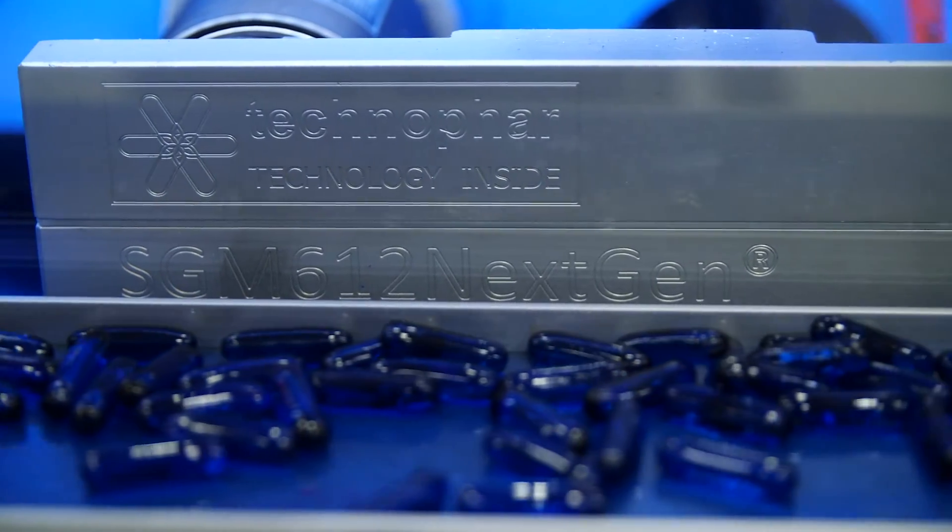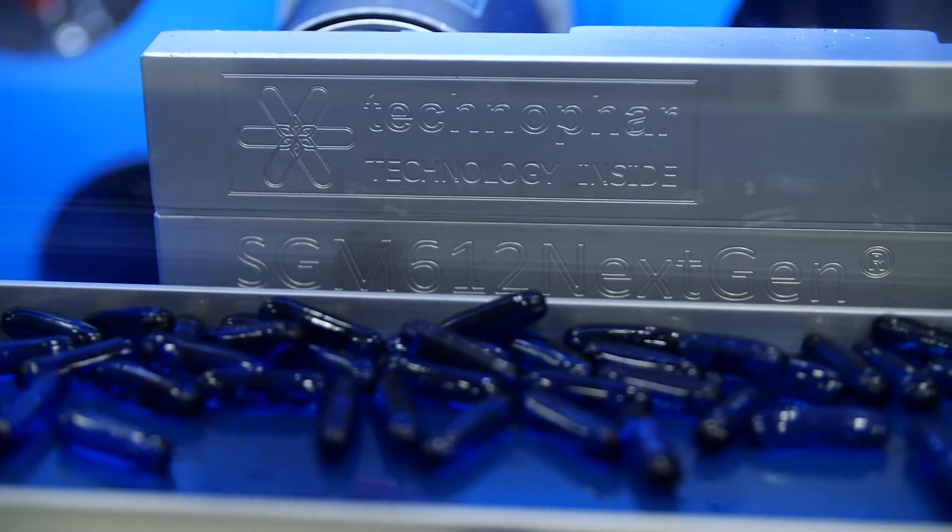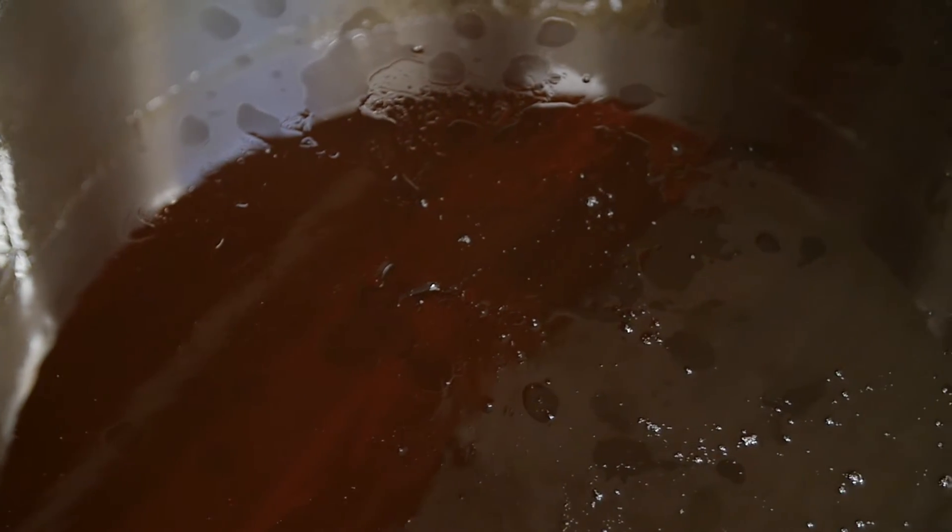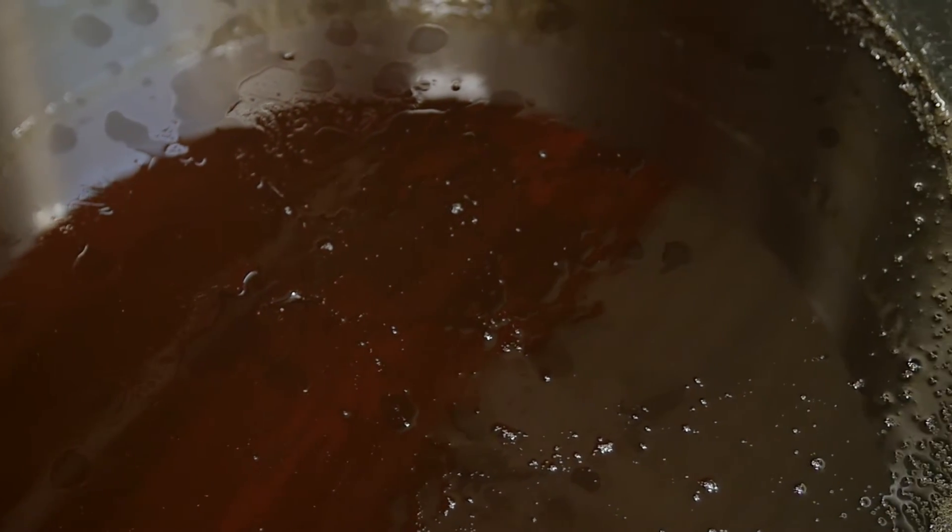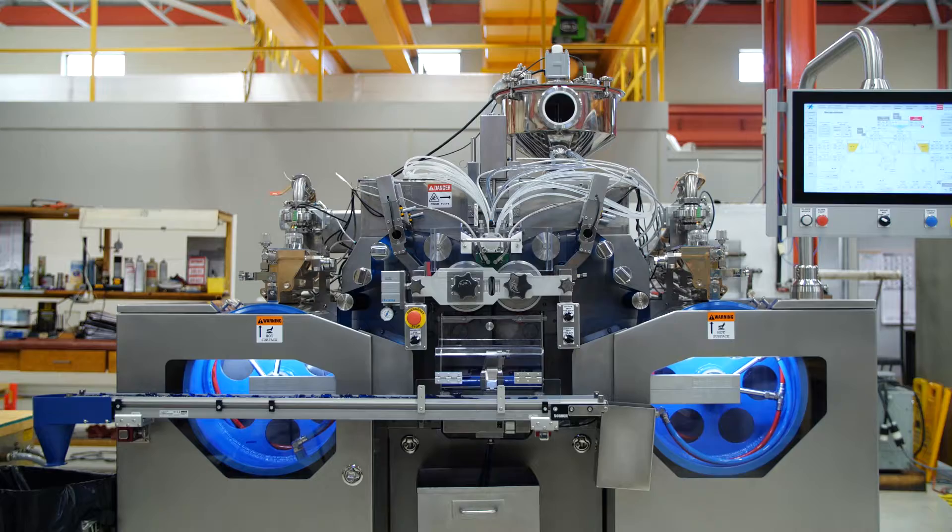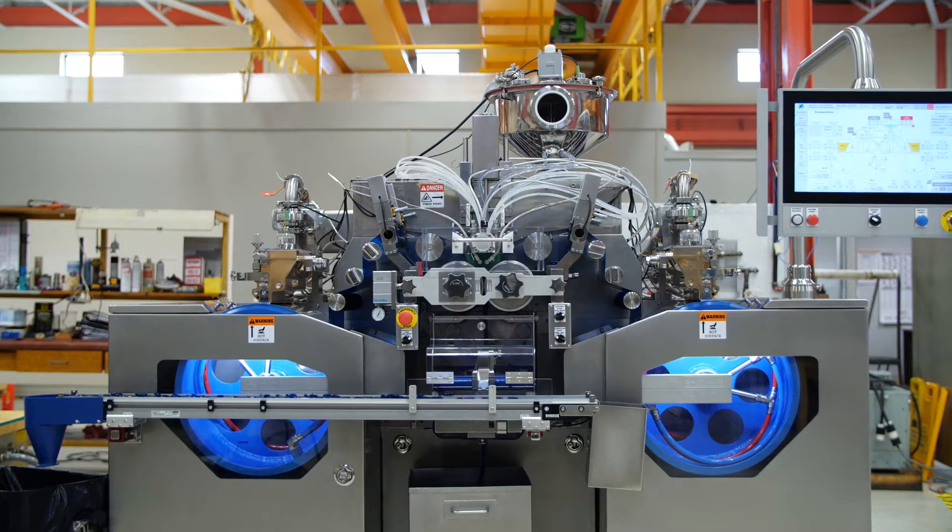The next step in the process is to prepare the capsule's ingredients for encapsulation. These ingredients consist of liquefied gelatin, which will become the capsule's exterior, and the capsule's liquid fill material, which can be in either oil, suspension, or paste form.